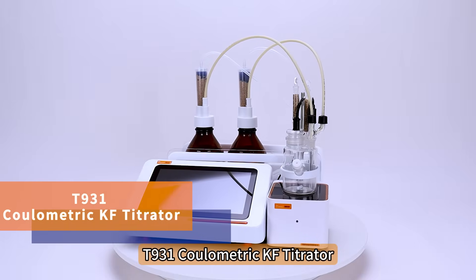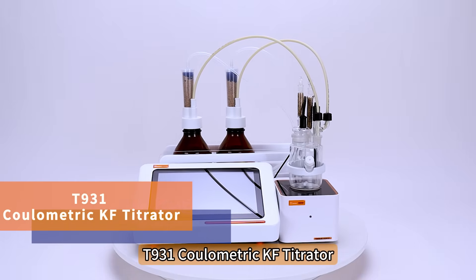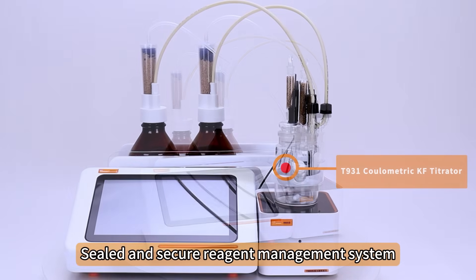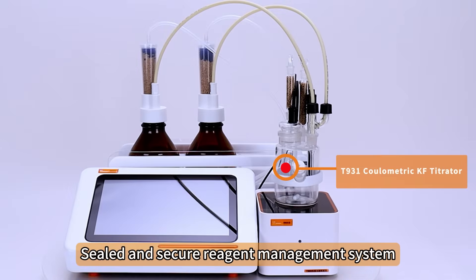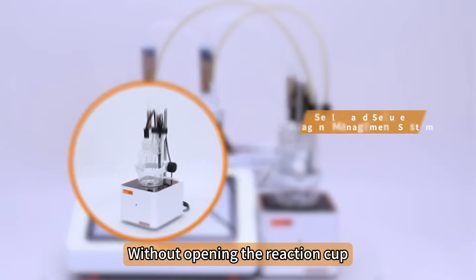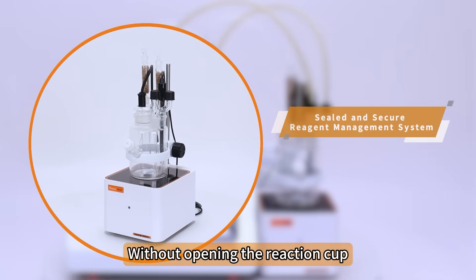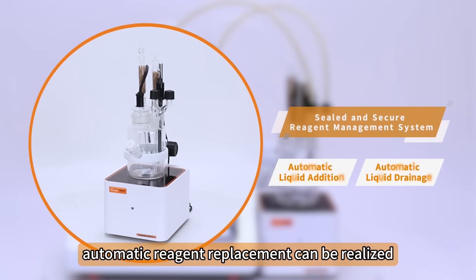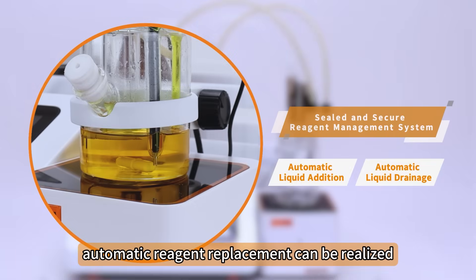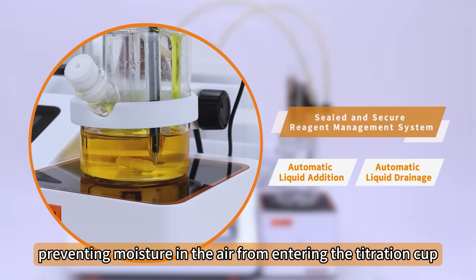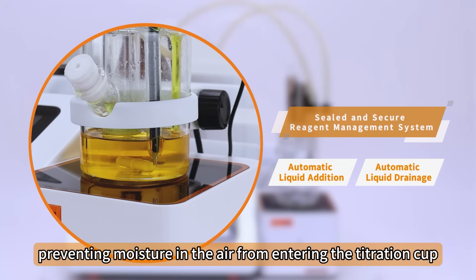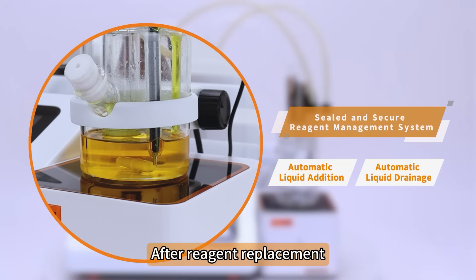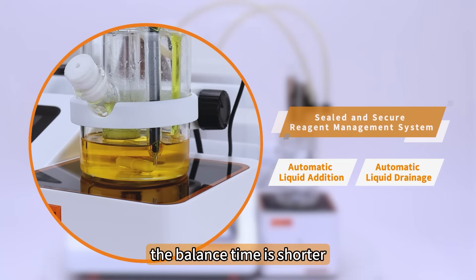T931 Coulometric KF Titrator features a sealed and secure reagent management system. Without opening the reaction cup, automatic reagent replacement can be realized, preventing moisture in the air from entering the titration cup. After reagent replacement, the balance time is shorter.